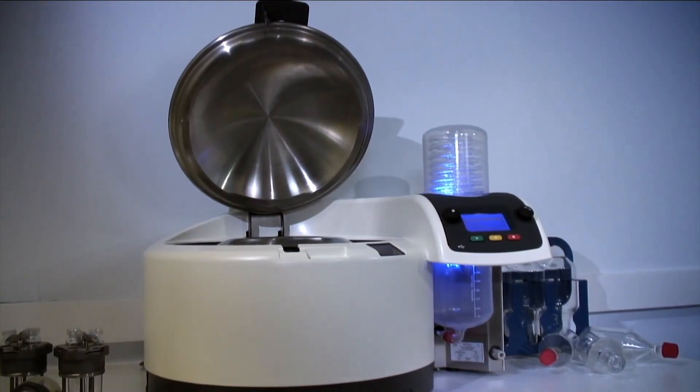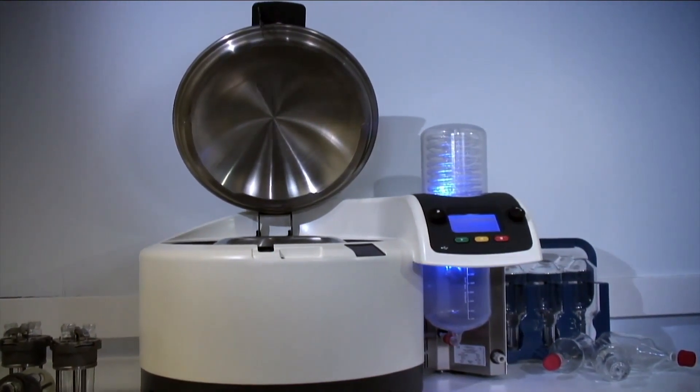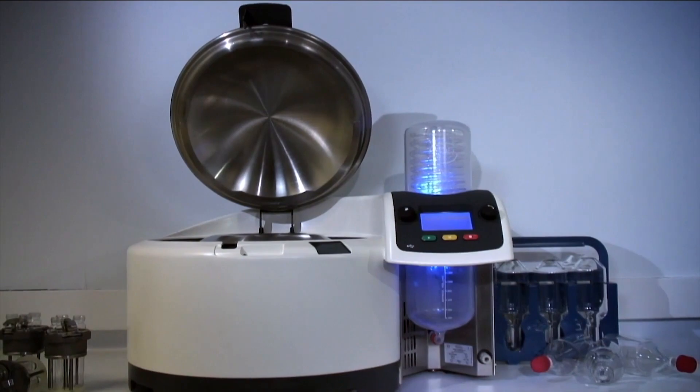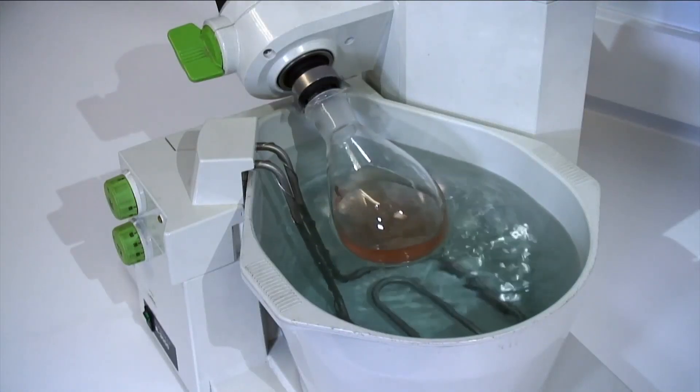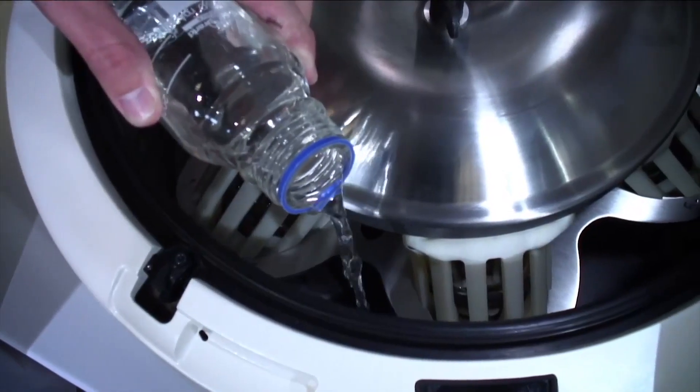To achieve very fast evaporation while maintaining sample integrity, the rocket has an innovative patented heating system. Infrared heat lamps or water baths are used by many traditional technologies. The rocket uses steam.